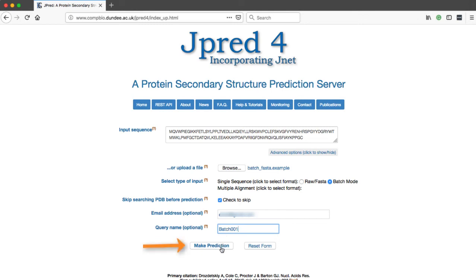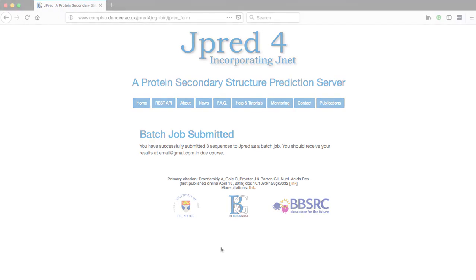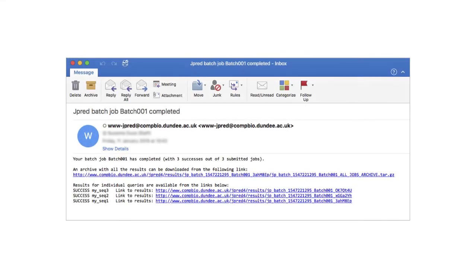Click the Make Prediction button on the web page to submit the prediction. Text will appear on the web page confirming that the batch has been submitted. An email is sent when the prediction is ready to view. Just click on the link to view the results.